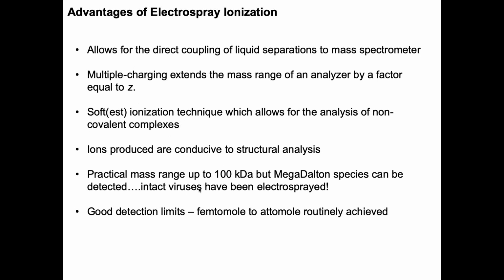Also you have to remember that the extraction, the analyzer transmission, and the detector technology have all gotten better. So you don't have to be as dialed in as you used to be to get good signal. I don't know if that answers your question. Probably one for a more detailed offline discussion. Good question.